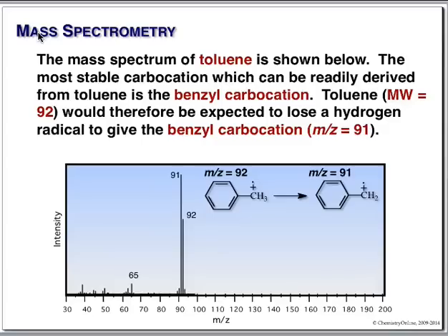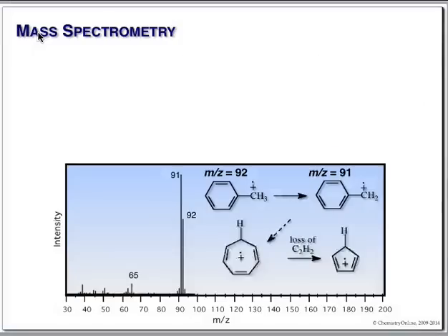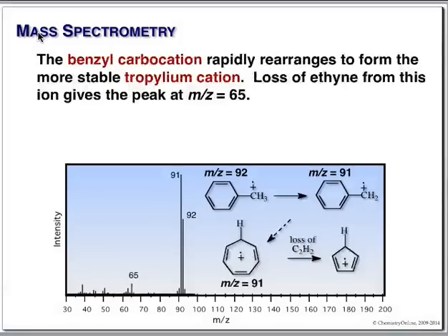Actually, this isn't a benzyl group here. Remember, benzyl groups can undergo rearrangement quickly to form what's called the tropylium ion. In a mass spec, whenever you see a peak at 91, it tells you you have a benzyl group in your molecule and you're forming the tropylium ion.